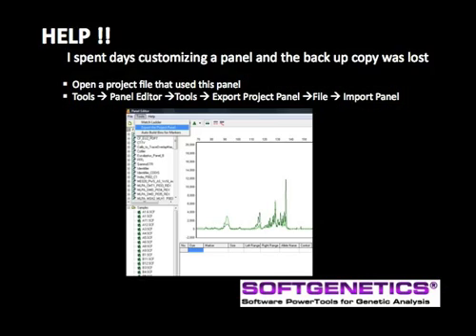But in case the backup of a custom panel was not performed, just use the Open Project function in the main screen of the program to open the project that was used to create this panel. In the Panel Editor, select Tools, Export Project Panel, and then select File. Import the panel and save the panel to the GeneMarker Panel Editor for continued development and use of the custom panel.